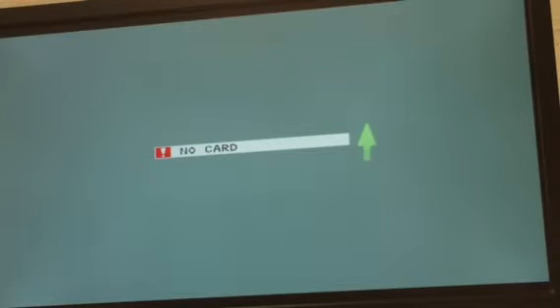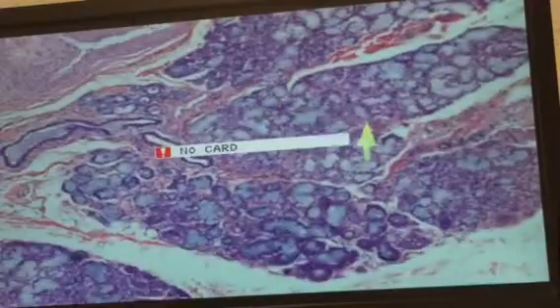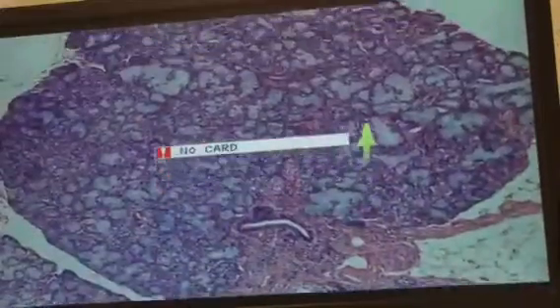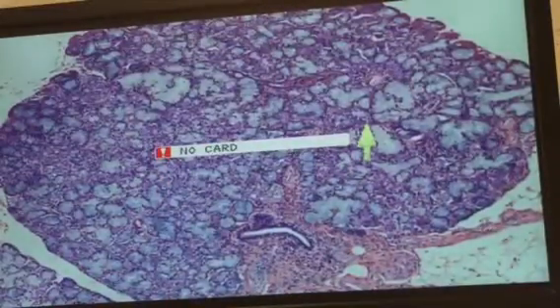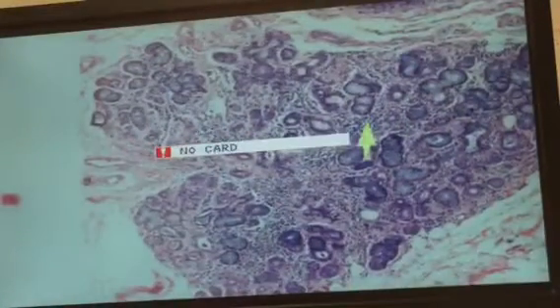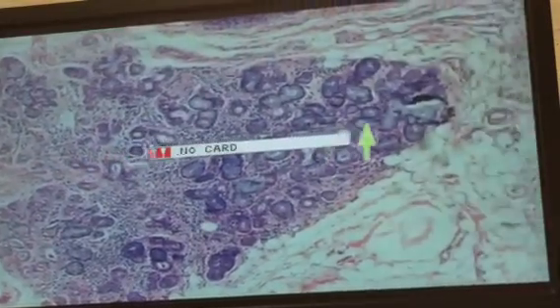Sublingual, one of the slides by Carolina Biological has towards the label side fairly decent sublingual architecture. But as we get away to the other side, it's quite a bit in the way of lymphatic infiltration. So something pathological is going on in this slide.